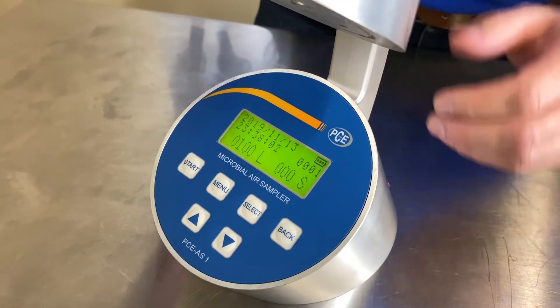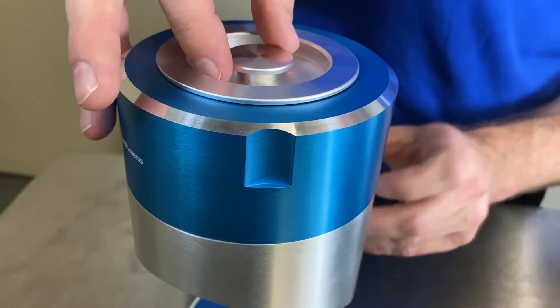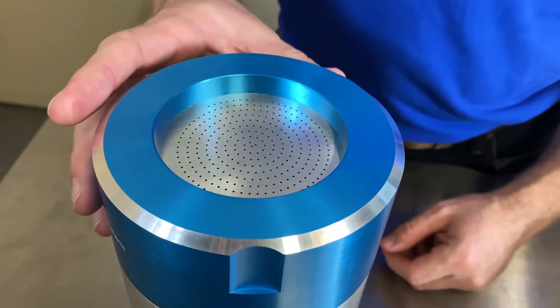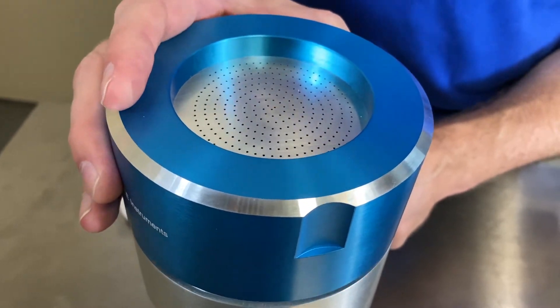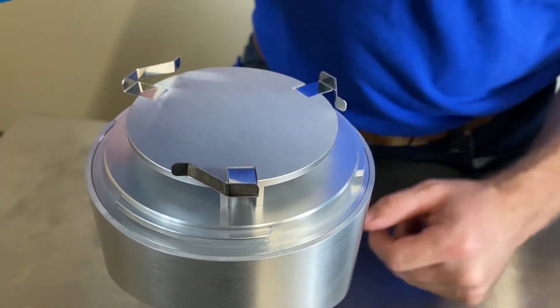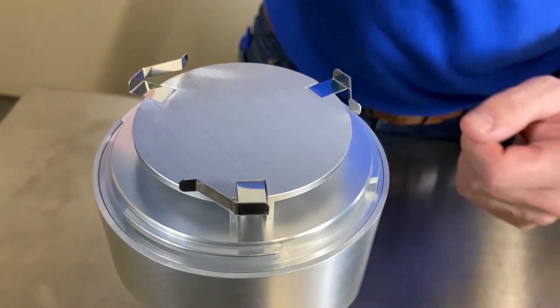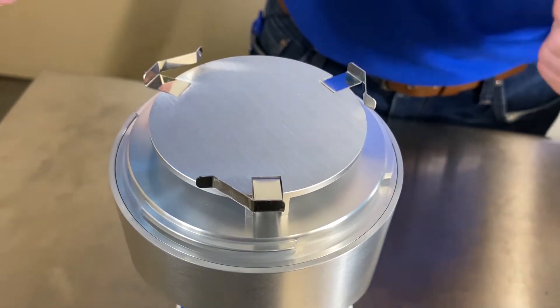It's got an adjustable head here. Up top is where the micropores are. This is where it's using the Anderson collection principle. The air is being drawn through these micropores and hitting the top of the petri dish, which would go right here. And after the sample is complete, you would take your petri dish and incubate it for about 24 hours and then you would read your fungal counts.